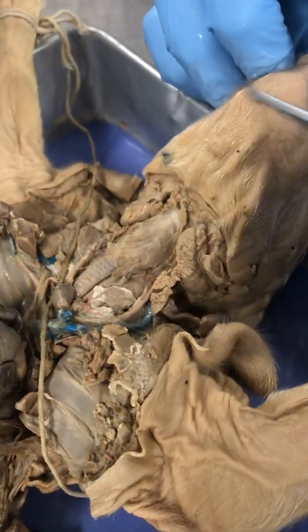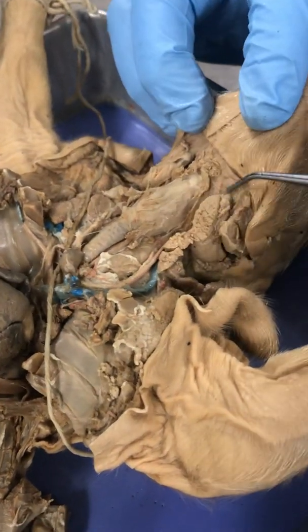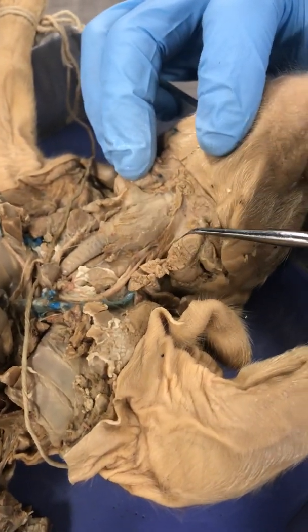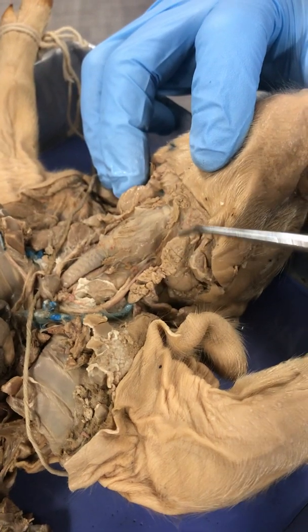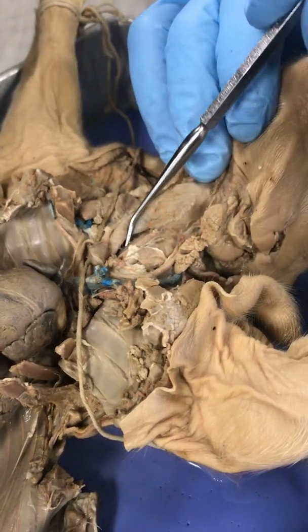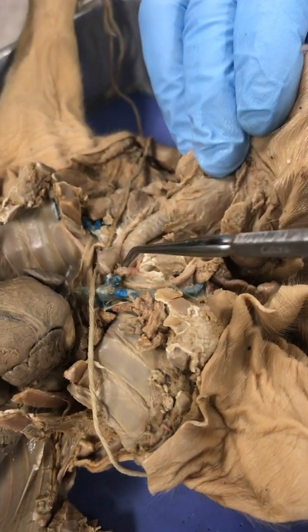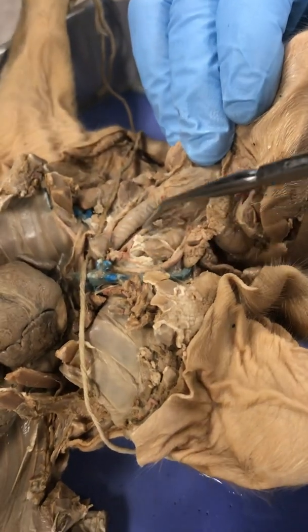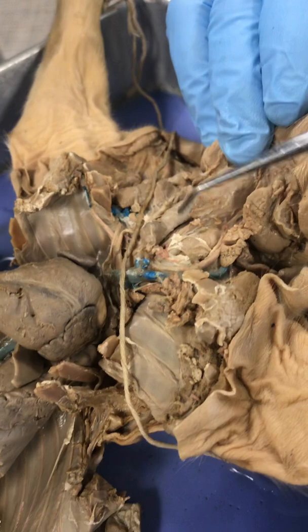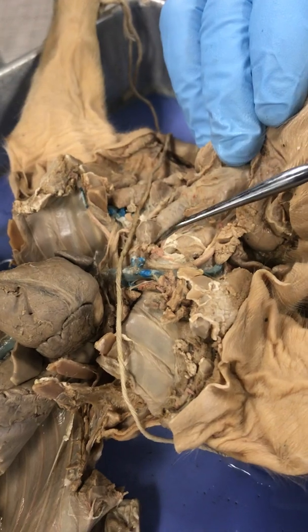It's always easier to enter from the mouth region to see that as opposed to trying to cut in here. You also have these two glands that sit lateral to the larynx. These are the salivary glands. Then, of course, you have the trachea, and posterior to the trachea, this tube that is the point where food is being routed down to the stomach. That would be the esophagus. Then this little structure, a gland, overlies the surface of the trachea. That's the thyroid gland.